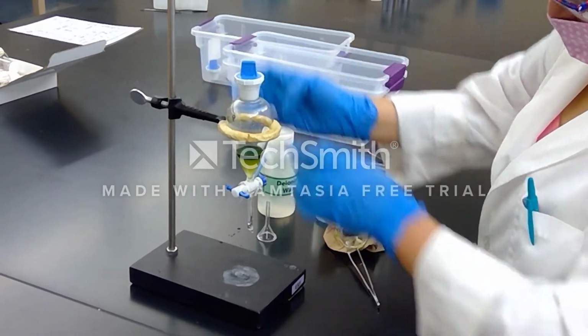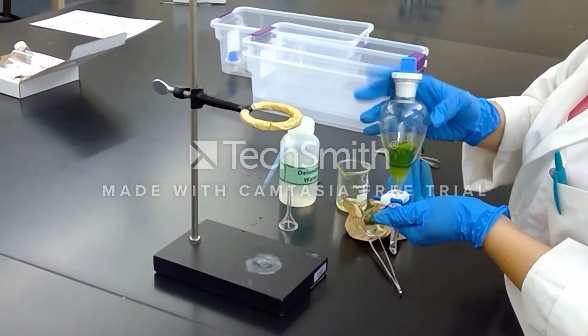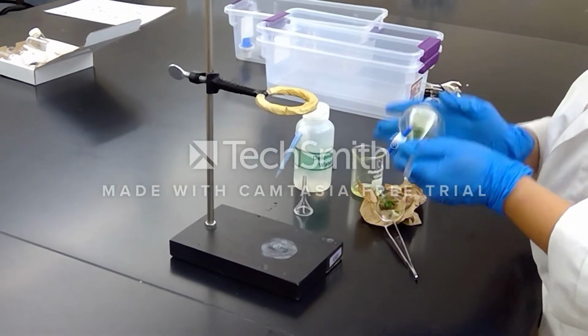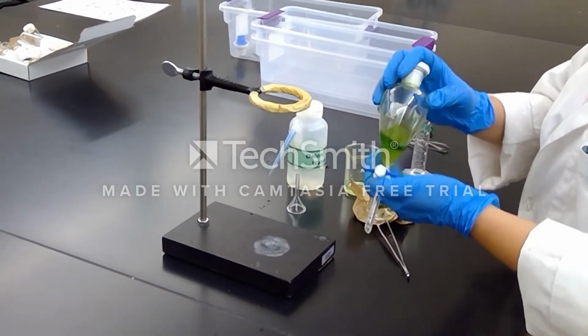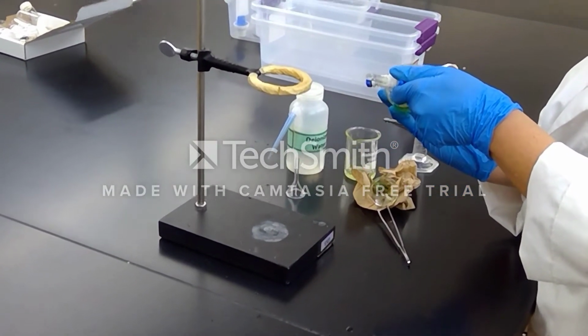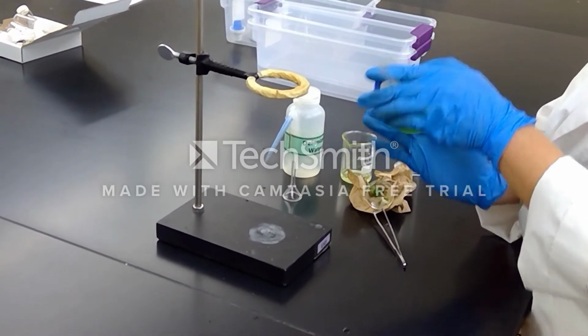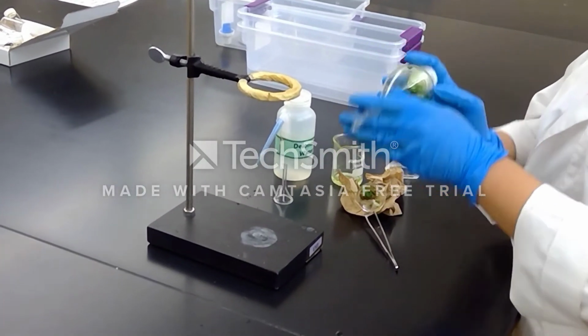And I'm going to add the cap to my separatory funnel, and we're going to go ahead and invert, just like you saw in the extraction of caffeine experiment. We're going to invert a couple times, and then I'm going to go ahead and vent. Did you see that water droplet pop out? Yes, you do still produce some carbon dioxide in this experiment, so it's important to vent.